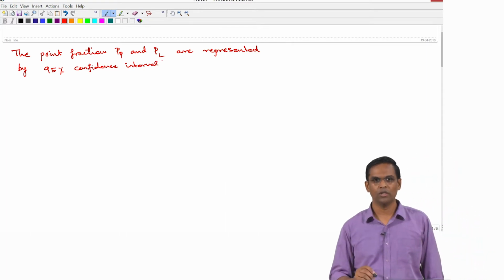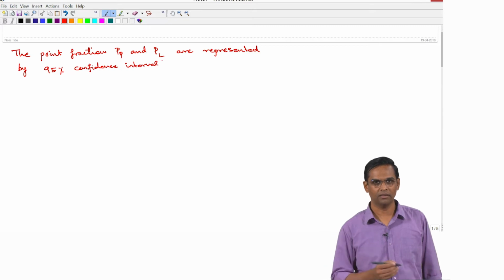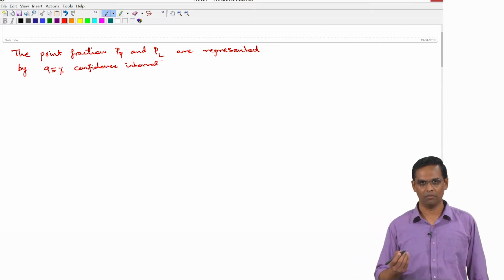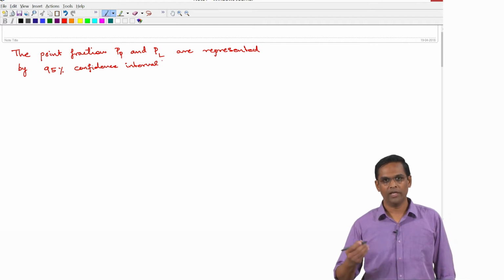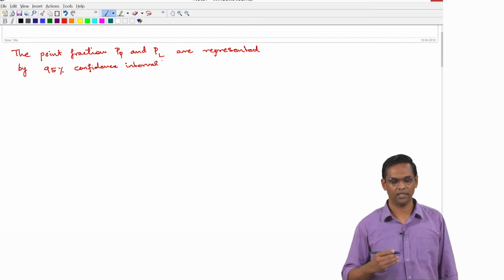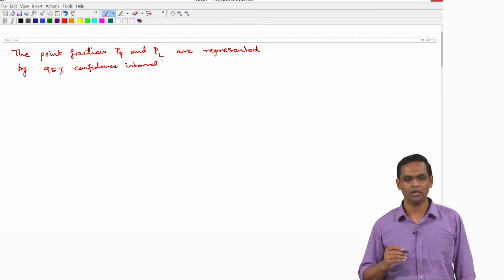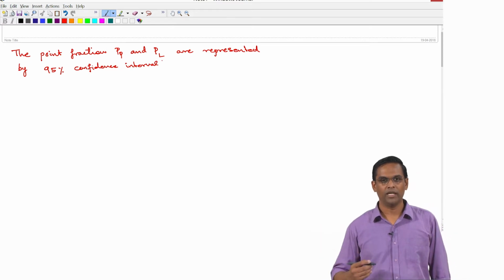So, we are going to format the data we have got. If you look back at that Excel sheet, we have about 42 data points or 42 events, a small n, and we collected the number of points intersecting the nodular cast iron microstructure, and also we calculated the PL.